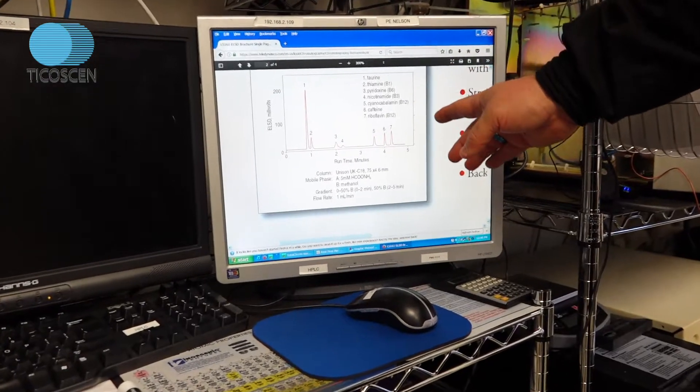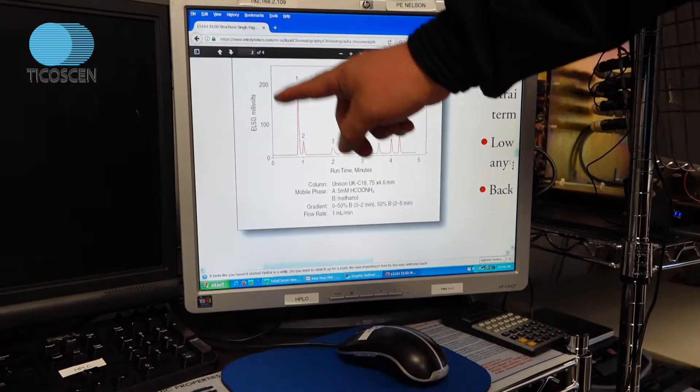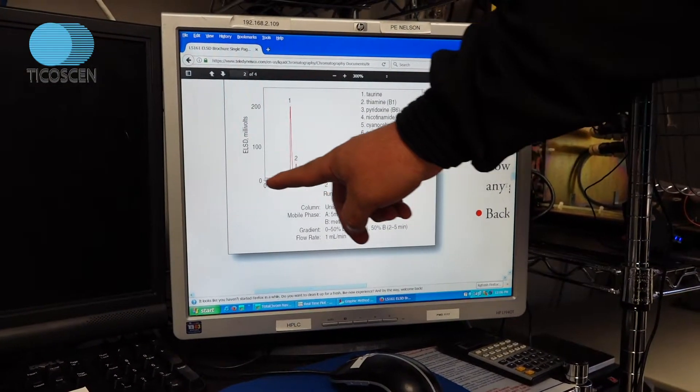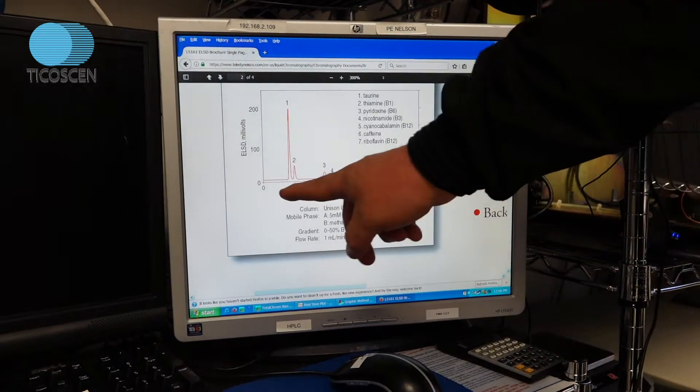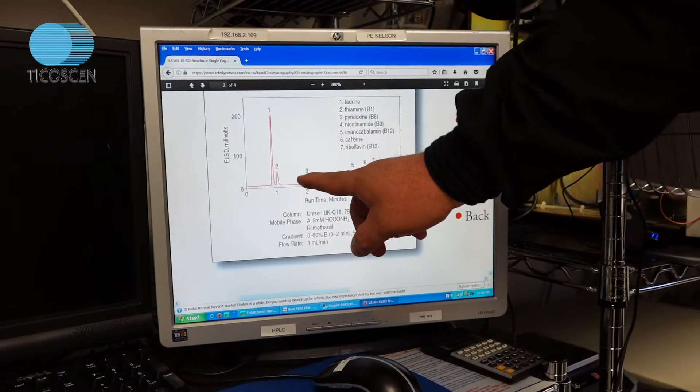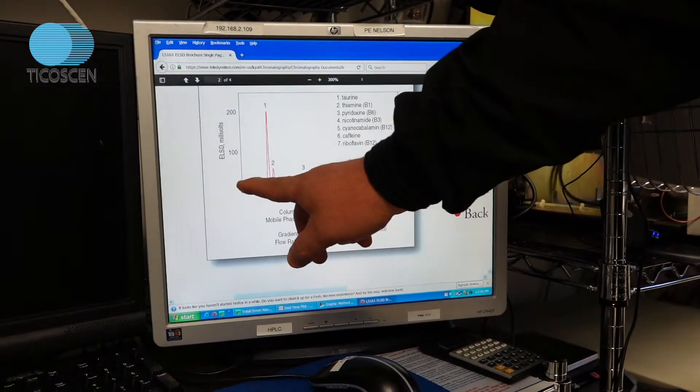Okay, this is an ELSD chromatograph in millivolts, 0 to 200 millivolts vertical scale. And here's your time, 0 to 5 minutes. And this is an example of one, two, three, four, seven component compound.